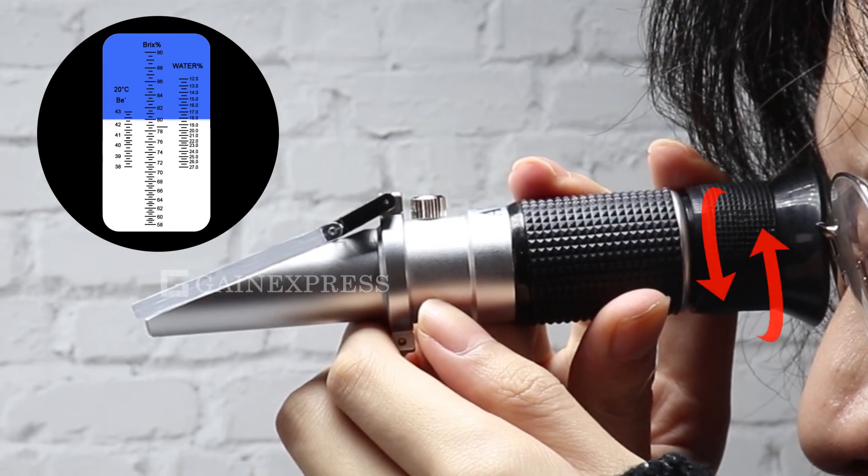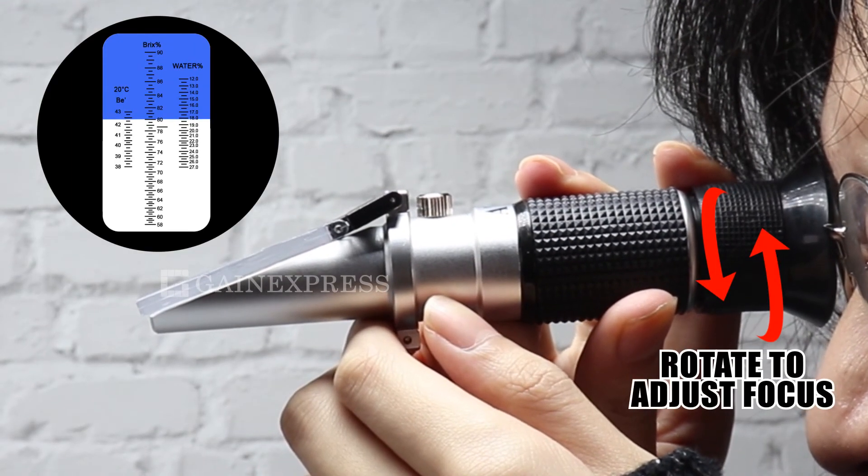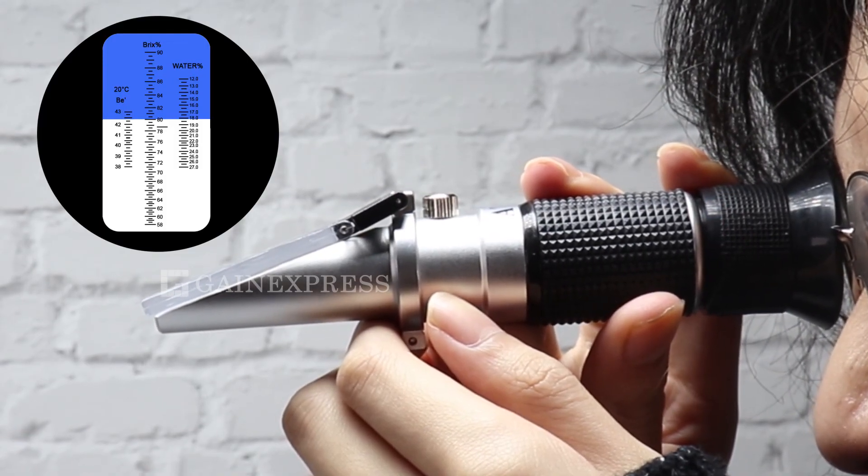Aim the front end of the refractometer in the direction of light. The scale will provide a direct reading of the concentration.